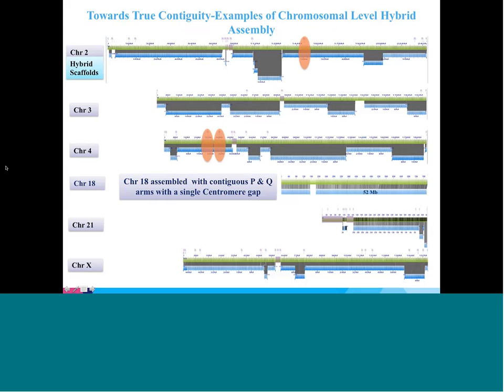One of the things I would say is even in regions in the reference that are gaps, there's a lot of regions marked by these pink gaps. These are regions in the reference which are basically just blocks of Ns. Even in these regions, we're able to cover a number of them, especially if they're small. We just run right through them. In some cases, our maps will overlap. This is fairly infrequent because of the way we built the scaffolds. Most of the additional haplotypes are coming out separately in the sequence contigs that are separate from the scaffold as additional contigs. But occasionally you get these things overlapping, and these are very likely just alternative haplotypes for structural variations.